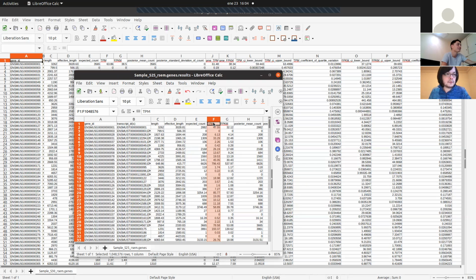I'm very excited here. I'm very happy to see numbers that I can use. From the numbers you can already kind of tell which genes go up and which go down, but you still don't have the gene names, so it's very difficult to do that.